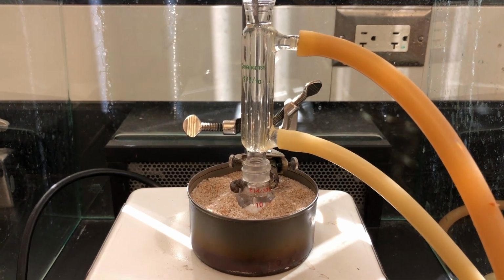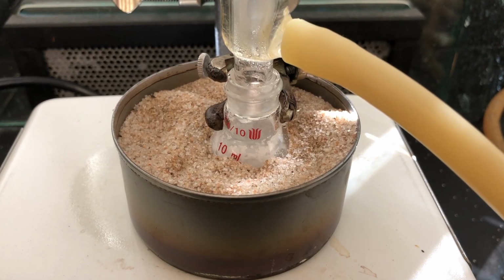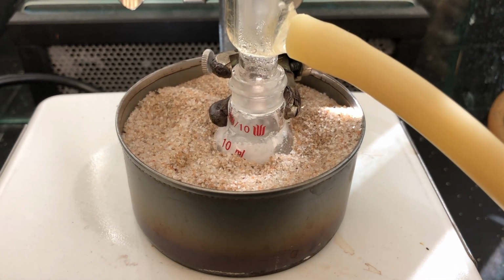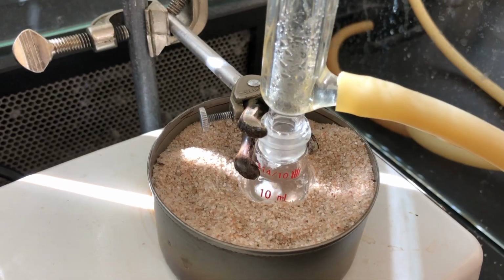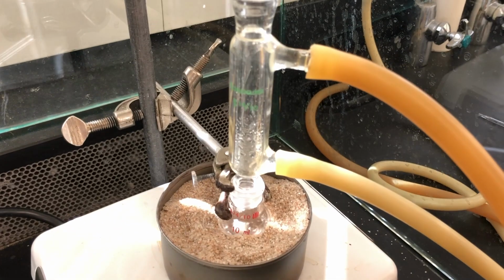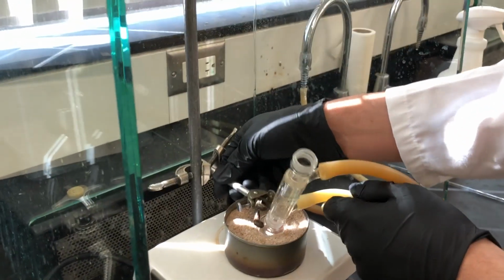So now we're going to heat it up in the sand bath until it hits reflux, and then we're going to wait 15 minutes. Okay, now we are at reflux, and we're going to stay at reflux for 15 minutes. After reflux, we'll let it cool down to room temperature. Okay, so we're finishing up the 15 minutes of reflux. We're going to turn off the heat. We're going to take it out of the sand bath.